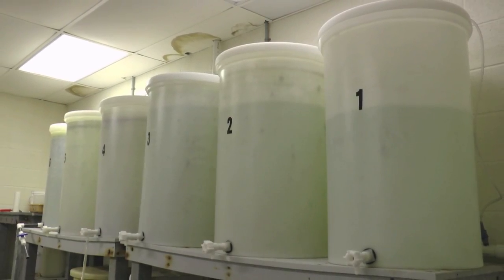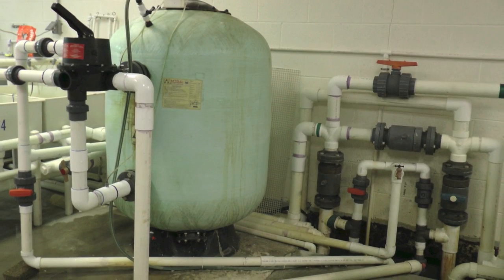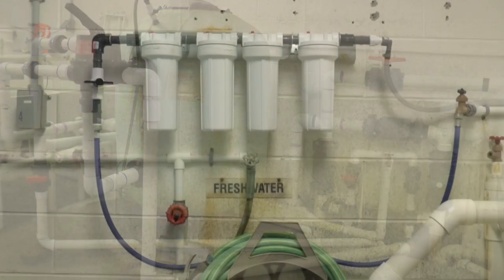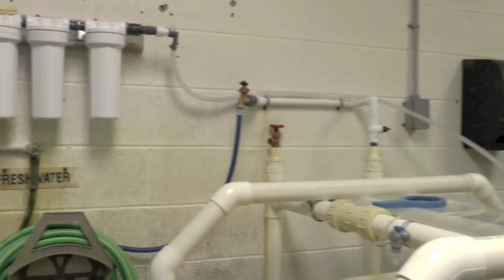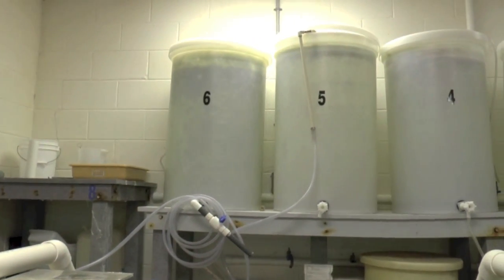The secret to barnacle culture is the water that the barnacles are kept in. Seawater is taken in from the ocean, sent through this big sand filter to remove large particles, through these 4 filters to remove smaller particles, and then aged. Aging the water is a biofilter step in which bacteria remove organics and metals.